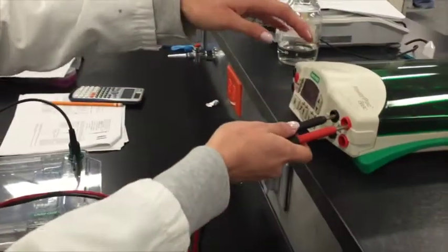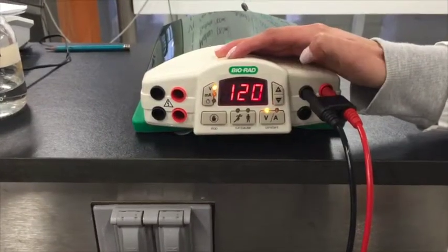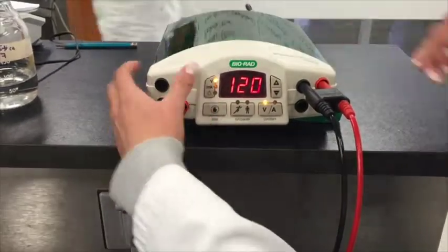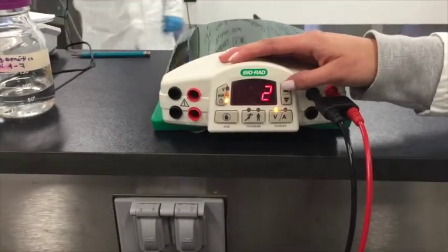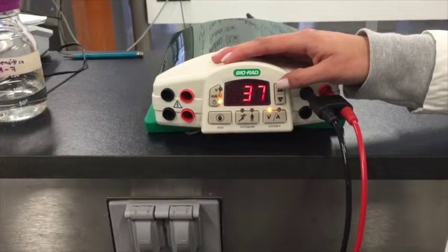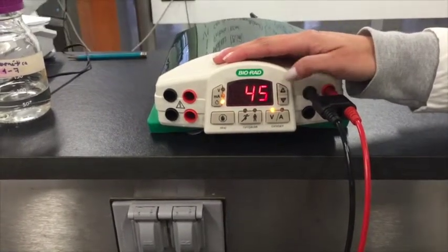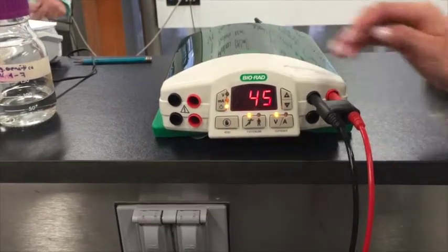As we have seen, the percentage of agarose, the size of the sample, and the voltage are important to consider when running an electrophoresis. For example, in the first gel, we saw that we have low percentage of agarose and high voltage, and the results couldn't be seen correctly. On the other hand, in the other gel, we saw that we have more percentage of agarose, the same voltage, and the results could be seen better.